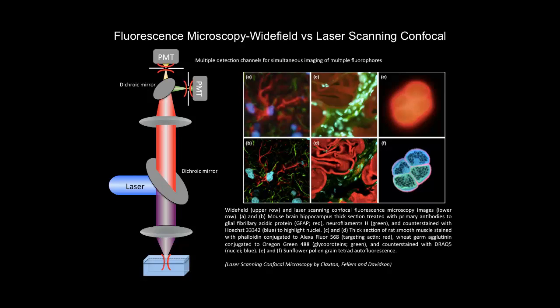And when you are interested to image multiple fluorophores, you can do that by splitting the excitation. I'm sorry, by splitting the emission using different dichroic mirrors. So you add one or more dichroic mirrors depending on how many fluorophores you want to detect, and then you use detectors and really detect the signal in different spectral windows, and then you overlap the detection channels to get this kind of images.